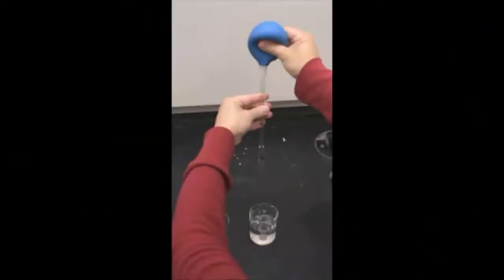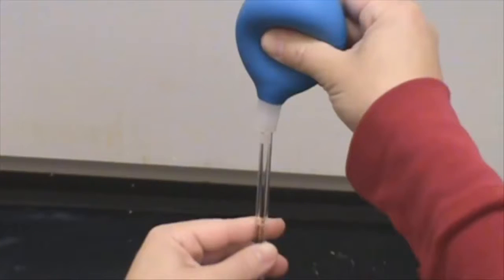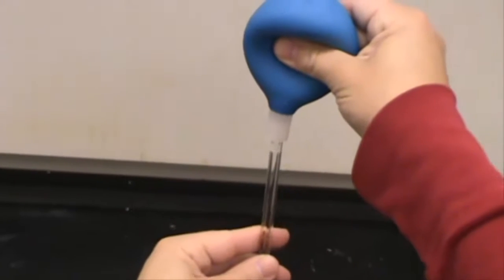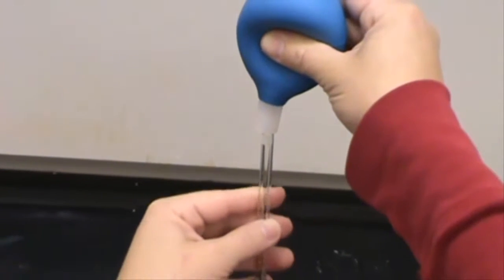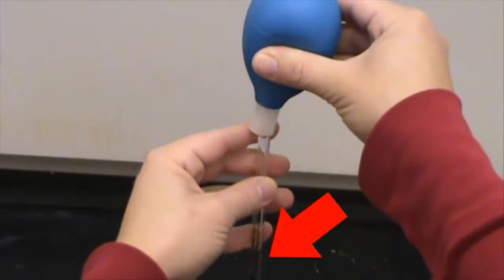A volumetric pipette can be tricky at first, so it's good to practice using a beaker of tap water first. Place the tip of the pipette in the water. You will be using a bulb to suck up the water. Squeeze the bulb, place the bulb firmly on the top of the pipette, and slowly release the bulb. Take up enough water so that the meniscus is past the fill line.